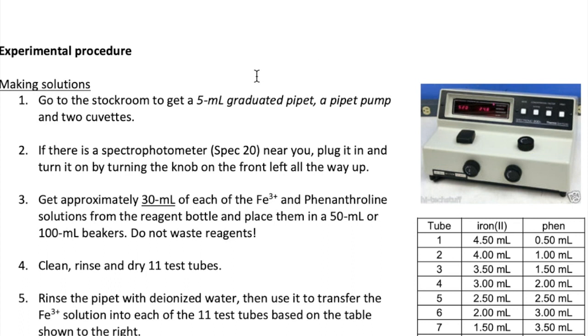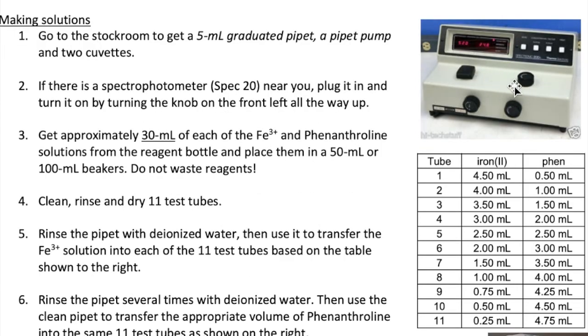First, have one student in your group check out a 5-milliliter graduated pipette, a pipette pump, and two cuvettes from the stockroom. If you have a Spec 20 on your bench, plug it in and turn it on by turning the knob marked here all the way to its maximum setting. This knob controls the intensity of the incoming light, so make sure it's set at the highest level possible.